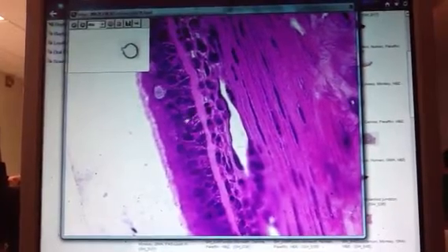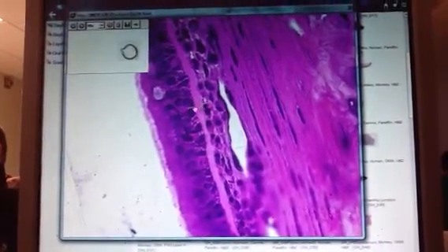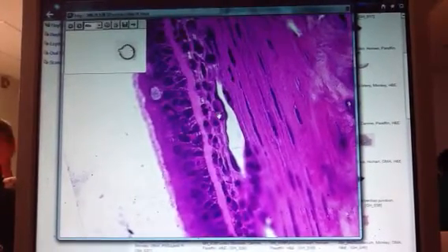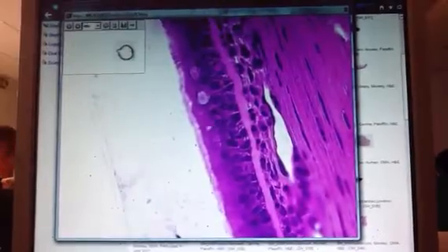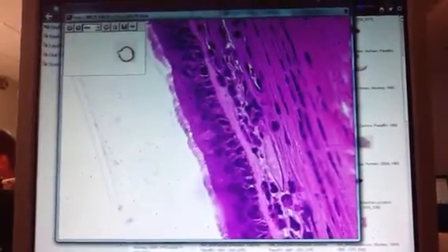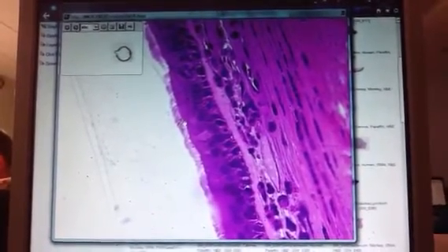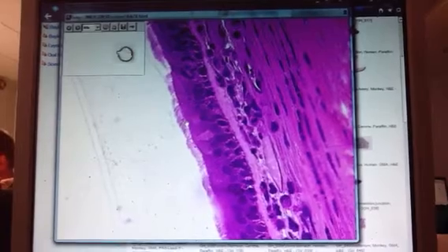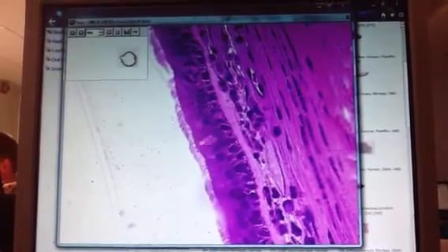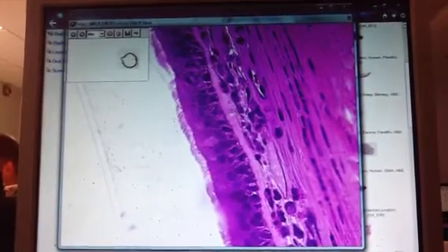So here's my epithelium, pseudostratified ciliated columnar, basal lamina, basement membrane, and we'll learn about this being a different tissue next week, okay? The cilia are the dead giveaway. And so when you look at spots like this, you can easily see individual cilia here, as opposed to those microvilli we saw before, it's just a mass of pink staining. Pseudostratified ciliated columnar epithelium, obvious cilia, very thick, obvious basement membrane.